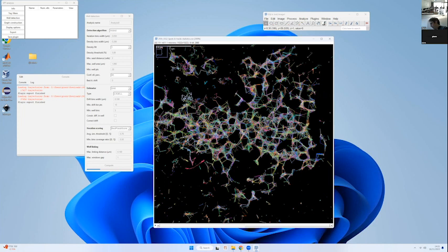Okay, so you run it, and we see the blue bar is calculating. Once you press compute, you will have this bar that will get filled more or less fast depending on your computer, and then you will have some results appearing.